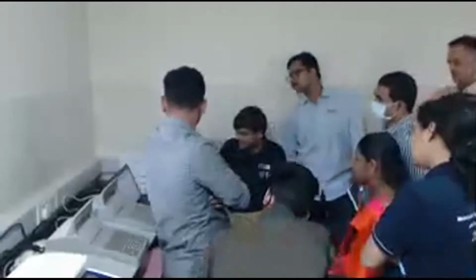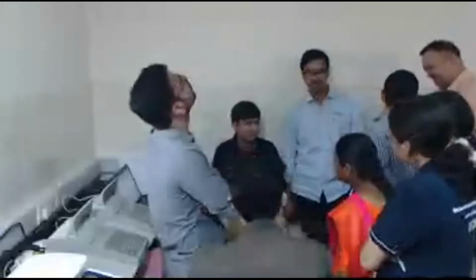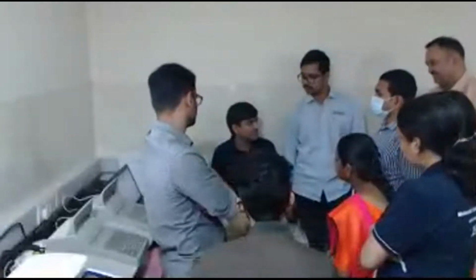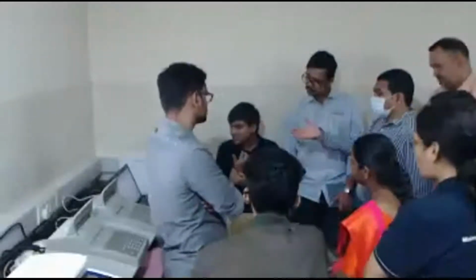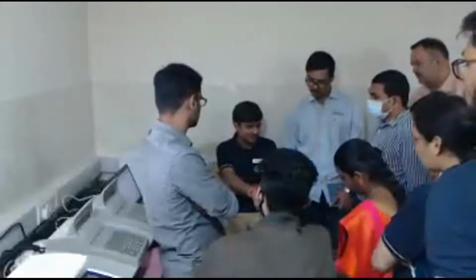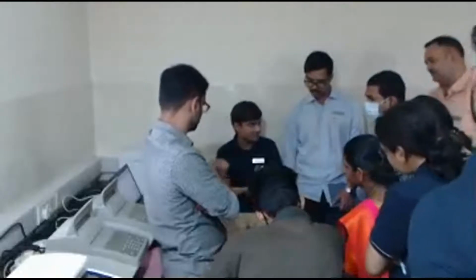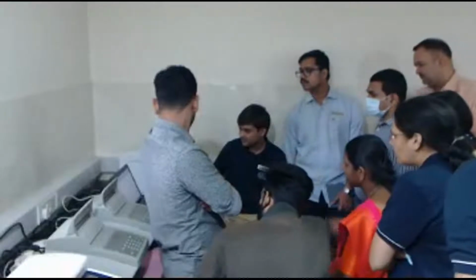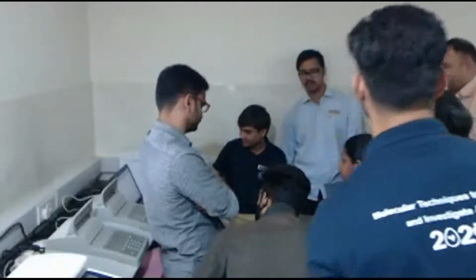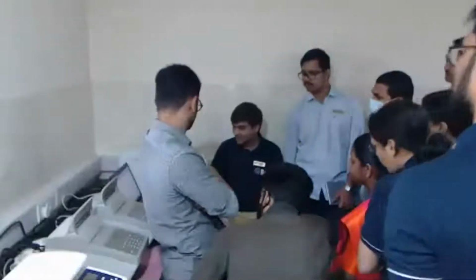So if we look at sample C, over here the pattern is different because the sample was different, and therefore the AMR genes might be different. And the concentration you can compare with what you have seen on the Qubit. So what you have seen in Qubit will also be reflected over here, right? So by seeing these results itself, we can say that there might be two chances.